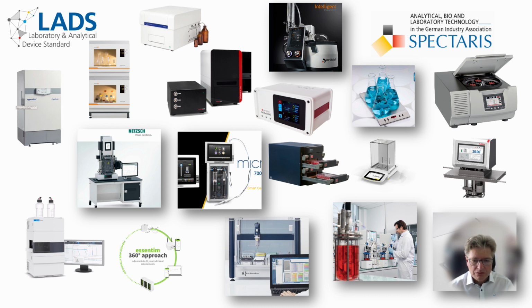Automation of workflows based on instruments which were not initially designed for automation integration. High flexibility, since laboratory workflows change often. Close collaboration with human operators. These requirements call for the integration of collaborative and mobile robots into laboratory workflows.